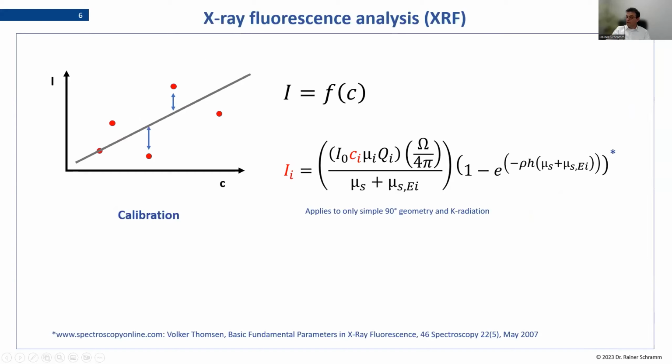And then the next question is, for sample thickness of any organic sample, you should look at the first column. Absolutely correct. You can take this graphite column, and then you have a good indication how your K radiation is behaving on the thickness. And of course, if you go to L radiation, you have to look where it fits into the table.